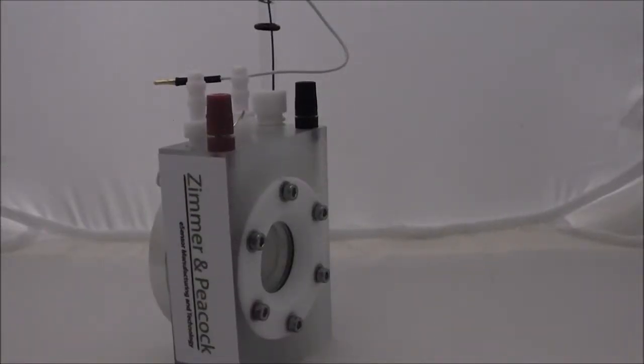Welcome to the PEC2 cell from Zahna. This is an electrochemical cell that allows photoelectrochemistry and electrochemistry experiments to take place at the same time.